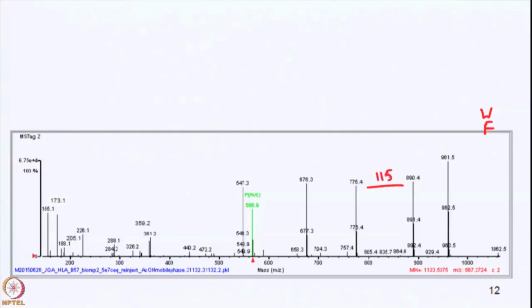Okay, wait a minute, so that's 71, 99. Let's put up this 1133. Okay, what can we do?